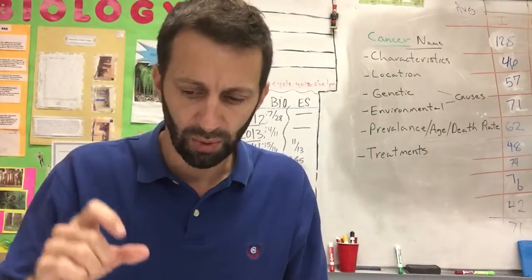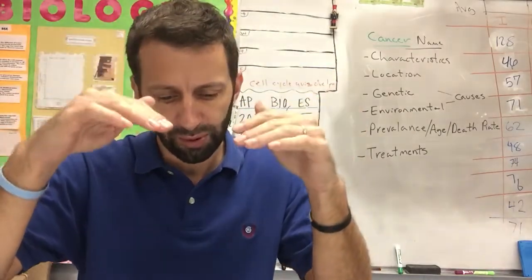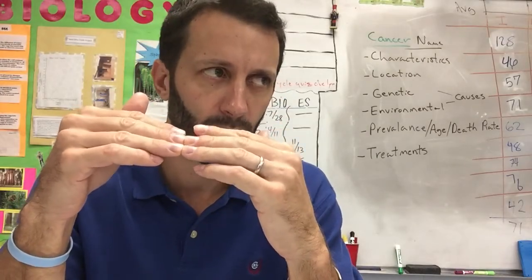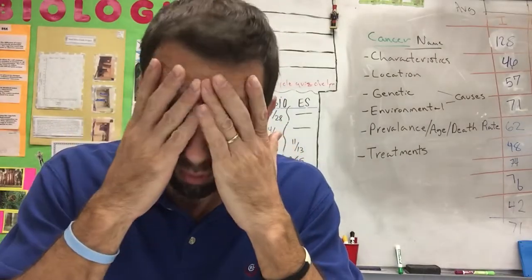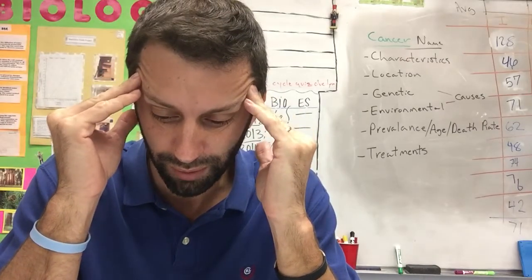mils, because the cups are kind of small. You're going to pour 40 mils of water in there, and we're going to see how much water flows through your soil in a minute. If we don't have any water flow through there in a minute, we'll probably let it go for 2 or 3 more minutes. And basically what we're measuring here is the permeability of the soil.